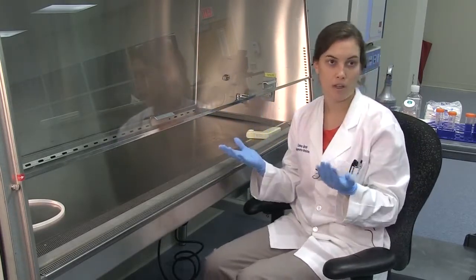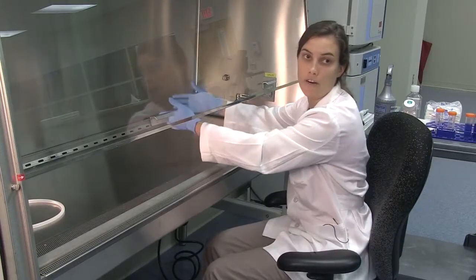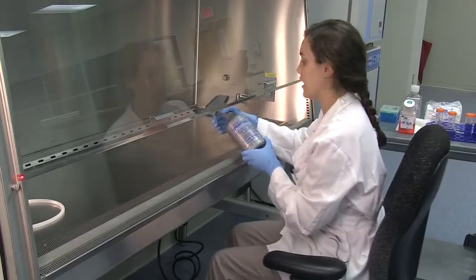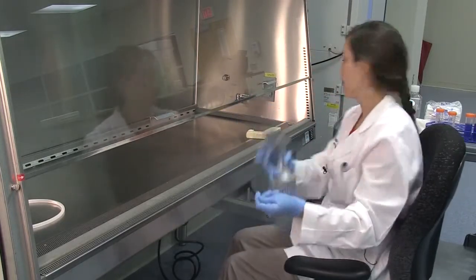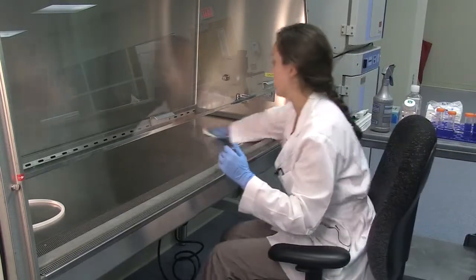It's important to always wear gloves and a lab coat so that everything going into the hood is sterile. Before working, spray the hood with 70% ethanol and also your gloves, which will help further clean anything inside the hood.